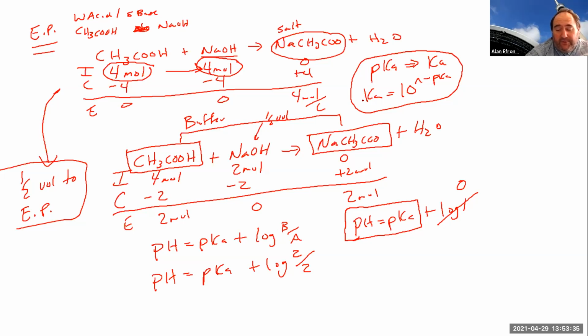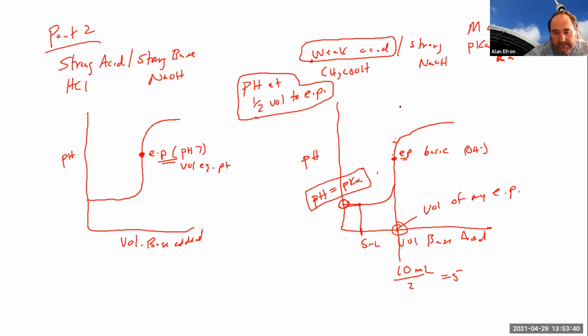Now, what I sort of showed over here is sort of the old school method. It's how we used to do it, plot it by hand, do a little lines, go over with some rulers. Nobody wants to do that. So what you're going to do after you, again, use the Chem Collective and do your titrations and your titration curves, after you do that, you're actually going to use a computer software program to analyze your titration curve.